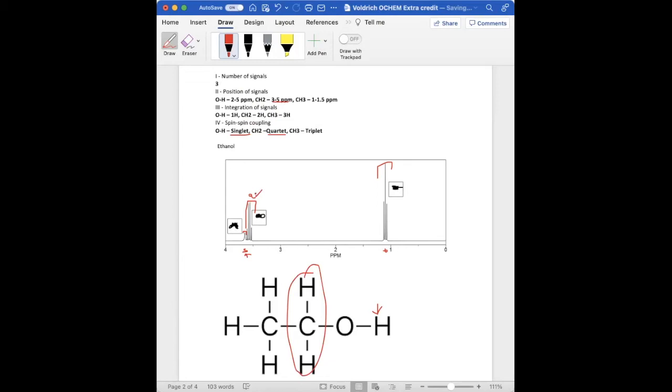So it'll be these peaks right here at 3.6. The last three hydrogens will be the least far downfield, and we'll have a triplet. It'll be the least far downfield, and it'll show as a triplet. So therefore, we can determine that this triplet is that one.